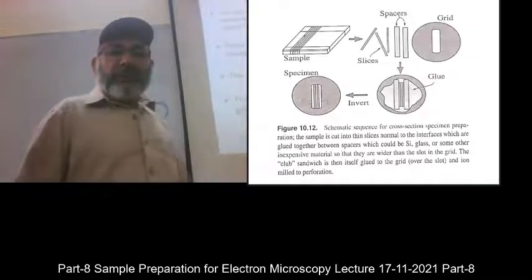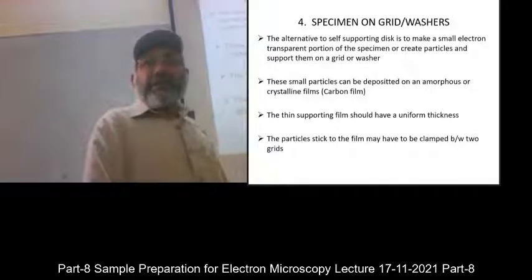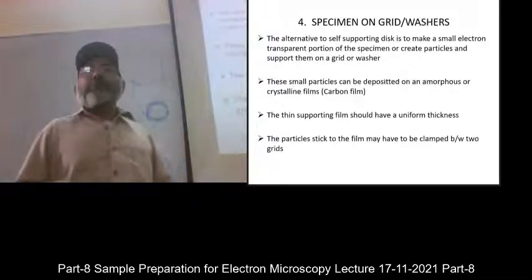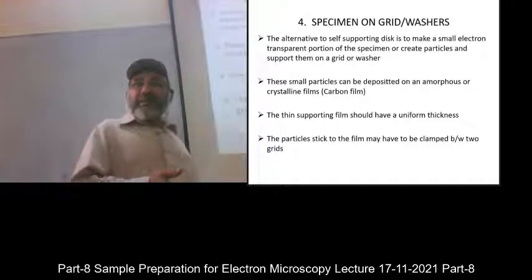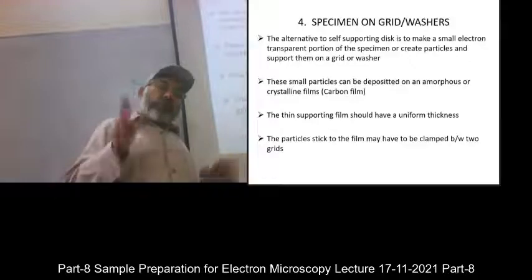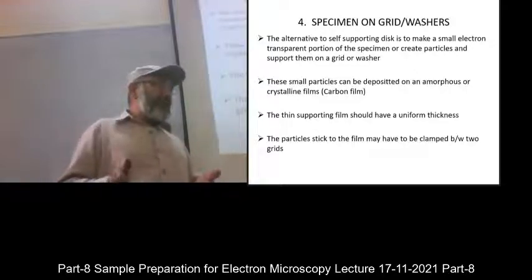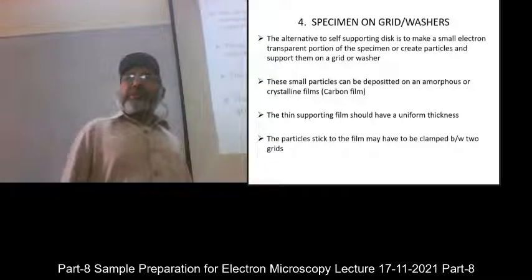And up to now, probably transmission electron microscopy is the most expensive technique as well. So you must think whether you need it or not. If you don't need it, then why waste time and money? So the first thing, you must look for what sort of information you need. Is it possible through a cheaper technique? If yes, then you are a bad researcher if you are using TEM.